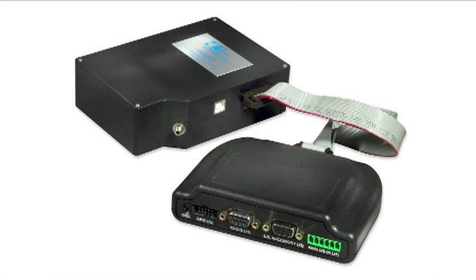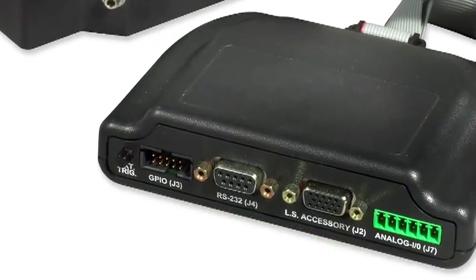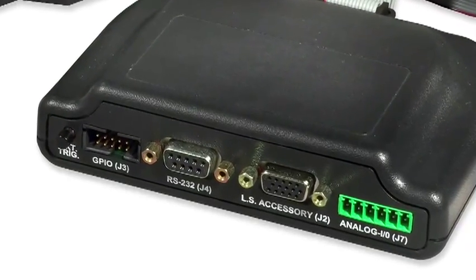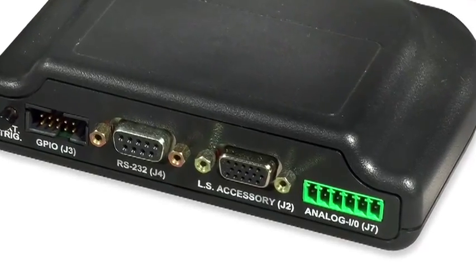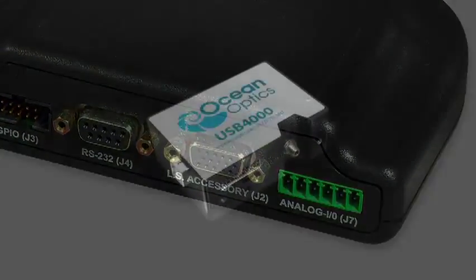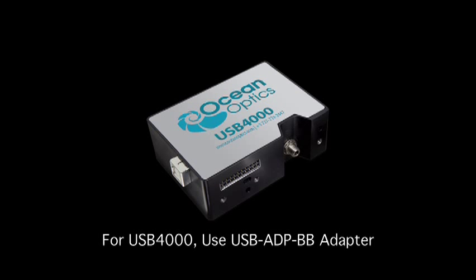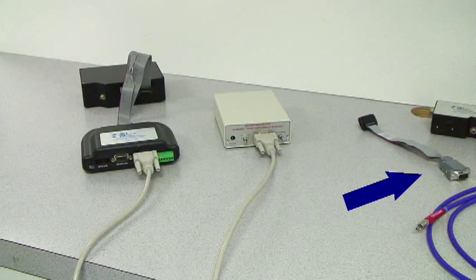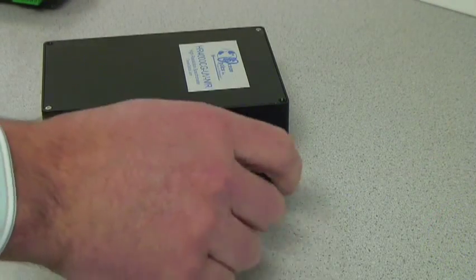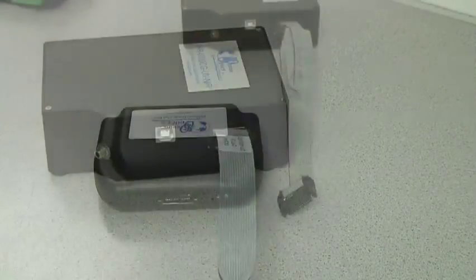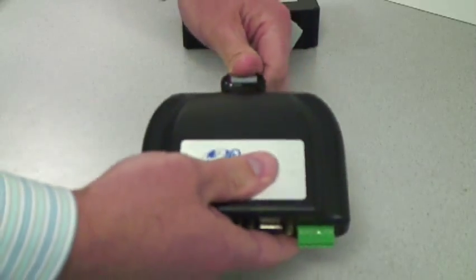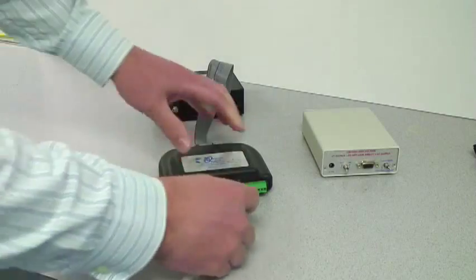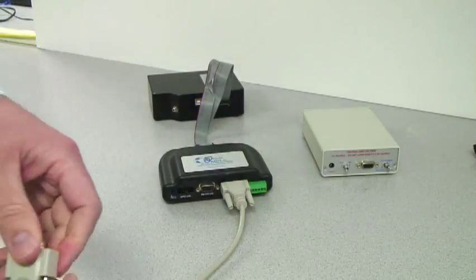The breakout box offers another option for connecting the PX2 to our spectrometers with the 30-pin connector. The breakout box is a passive module that separates the signals from the 30-pin port of the spectrometer into an array of standard connectors and headers. You'll want to use the breakout box if you need multiple interfaces to your spectrometer. Please note that if you are connecting the breakout box to the USB 4000 spectrometer, you must first attach the USB ADP BB adapter to the spectrometer. Use the HR 4000 CBL BB ribbon cable to connect your spectrometer to the 30-pin connector on the breakout box. Then connect the DB15 cable to the J2 connector on the breakout box. Connect the other end to your PX2.